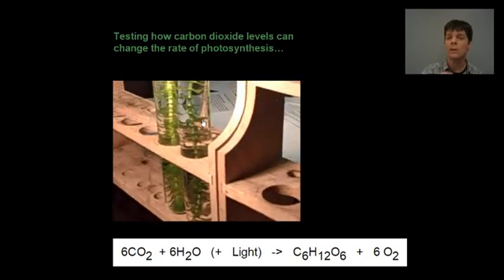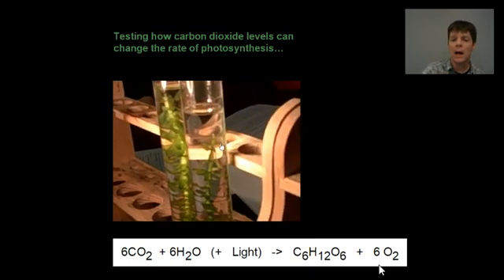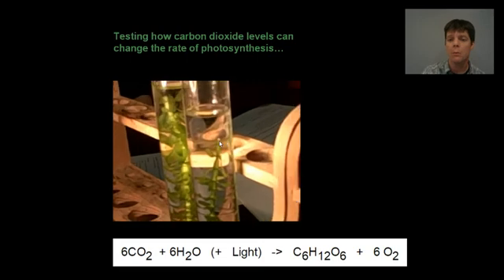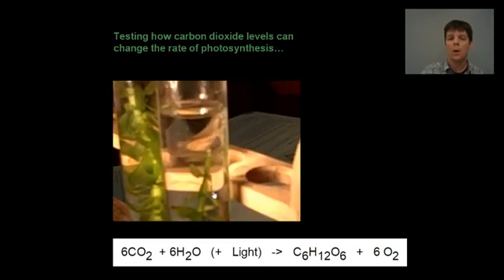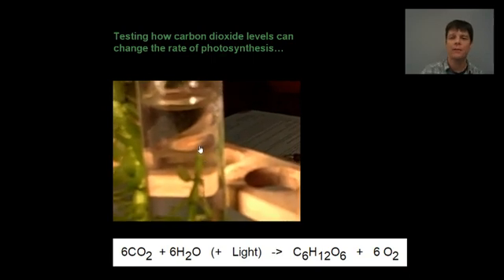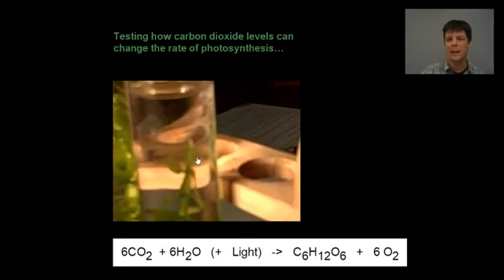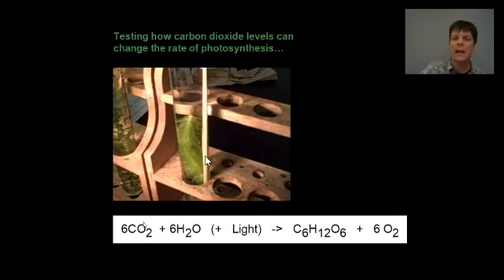What you're going to see is a bubble forming on the tip. The bubble that's forming is oxygen gas. This is one of the important products of the photosynthesis reaction. So, we're forming this gas. Actually, in the leaves, it's traveling through the vascular tissues of the plant, kind of like the plumbing system of the plant. And because we have a cut end, it's going to leave through that cut opening.